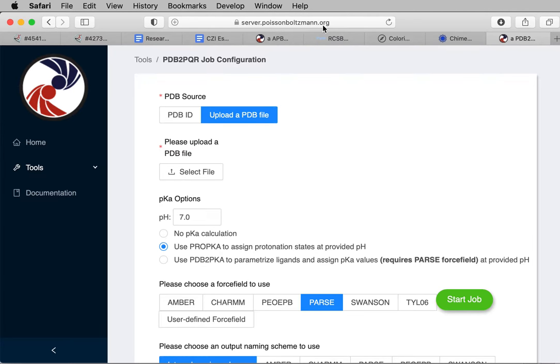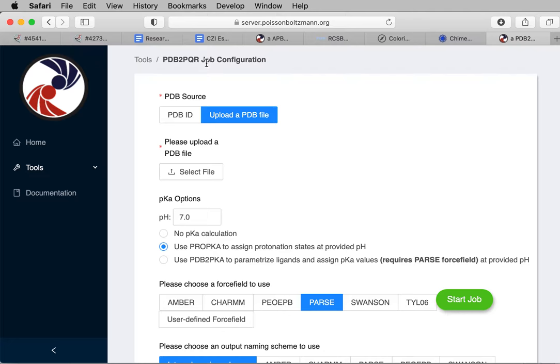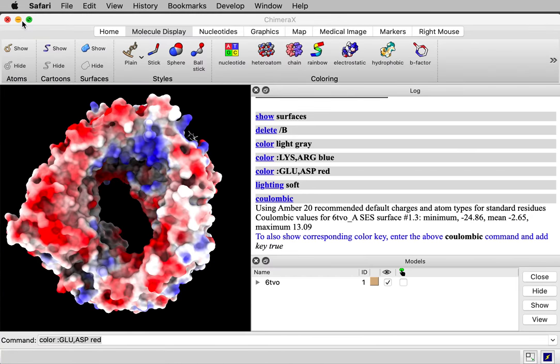It's here, server.poissonboltzmann.org. There are two parts of it. First, it computes the charges. That's a program called PDB to PQR. It takes the atomic structure and it produces this PQR file, which is the atomic structure with charges added in a column of the PDB file. Once you run that, you can then run the APBS program to compute the electrostatics. It took about four minutes for this protein. Let me show you the result.